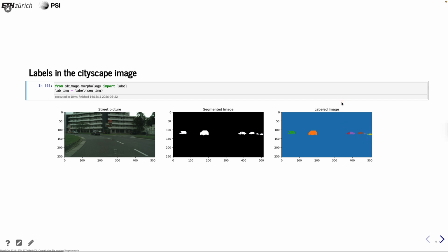It's chopped up into 3 different pieces. So this kind of labeling doesn't really sense that this is an object that should hang together. That is for you to interpret later, saying that it can't be this small, so either reject it or put some other effort into the analysis.